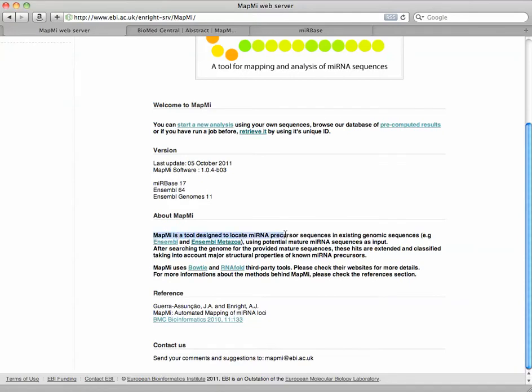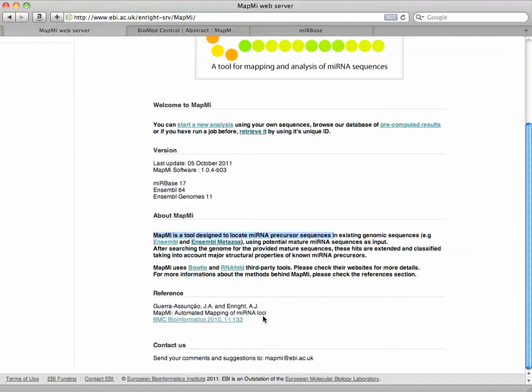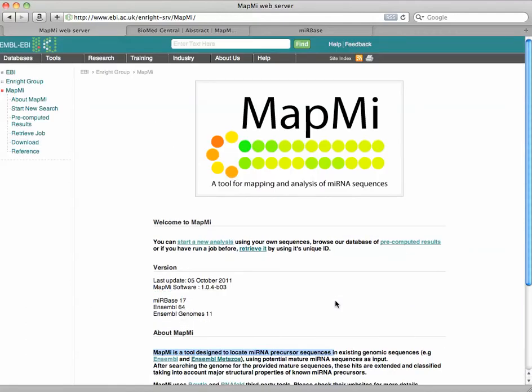MapMi is a tool designed to locate microRNA precursor sequences in existing genome sequences. They use Ensemble. As you see here, they use Bowtie and RNA fold in their algorithm. And there's a reference here that's also linked in our blog post.